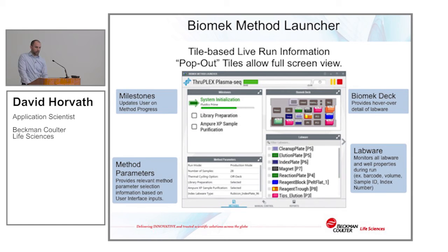The Biomek deck tile is interactive. As I mentioned, the previous instrument setup was a flat view. You couldn't interact with it at all. Now this view has hover over capability. So if you hover over any of these positions, it's going to pop up the labware type and the labware name if it has a specified name. And those plates will move and be represented where they actually are in the method at that current time.